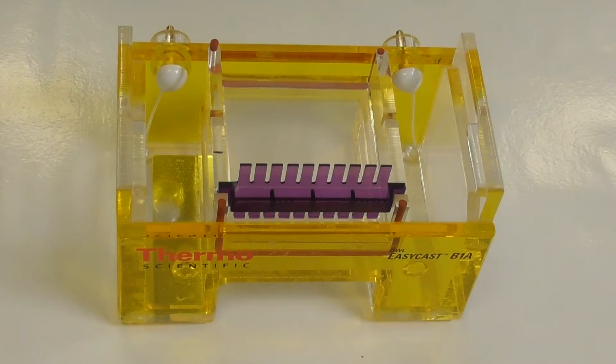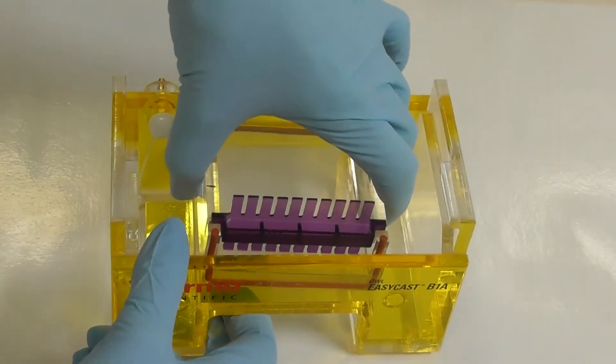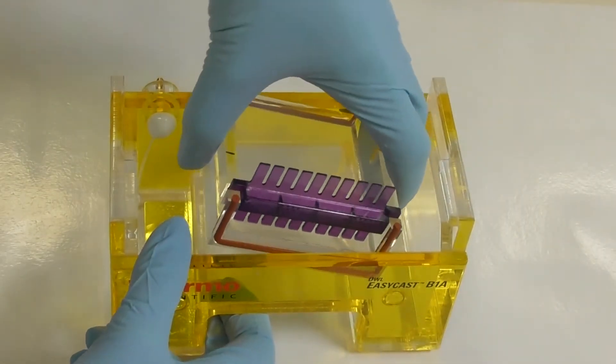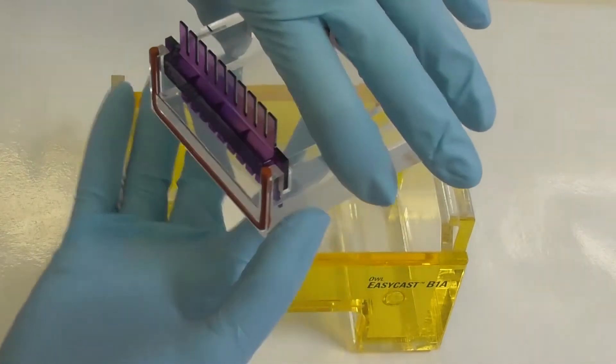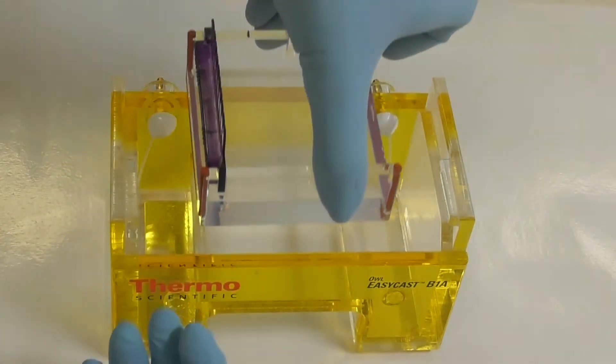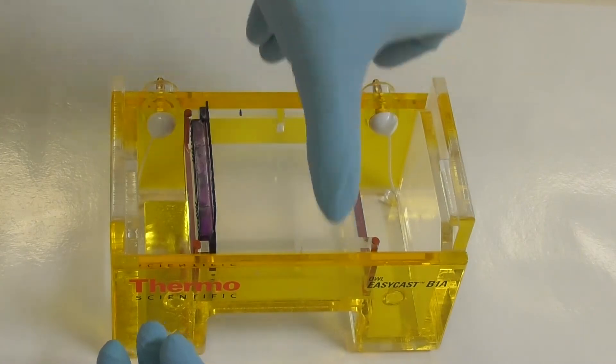At this point the gel comb must be placed into the molten gel in order for wells to form in the agar as it cools. Once the gel is cooled, gently remove the gel tray, rotate it 90 degrees and place it into the gel tank with the comb on the left.